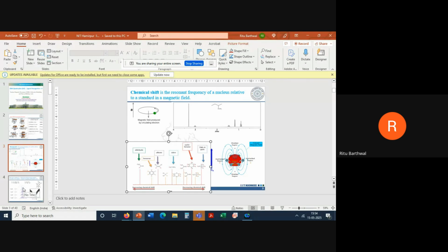So one thing, the first thing which NMR gives you is from the position where we get resonance. This is an actual NMR spectrum of some compound. From the position, and comparing it with a table, we can make out that there is a methyl group present, some CH2 or CH3 may be present. So according to the scale, we will be able to characterize. There are other things that we need for structure, and NMR will give us that.